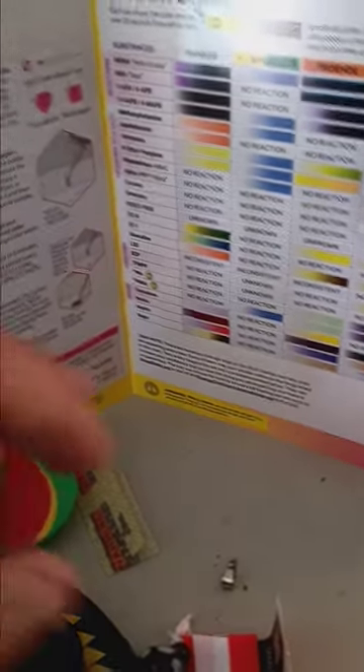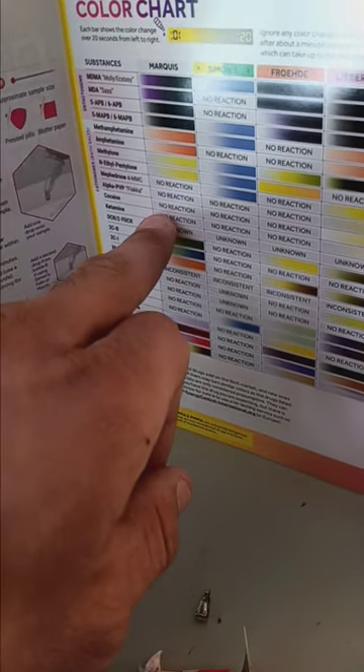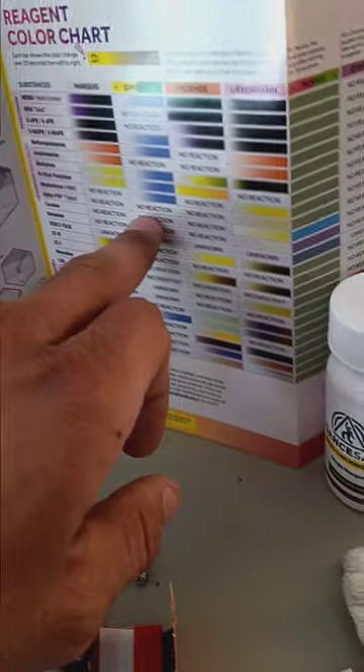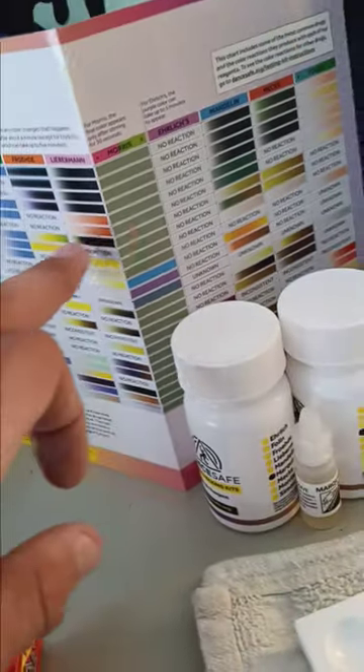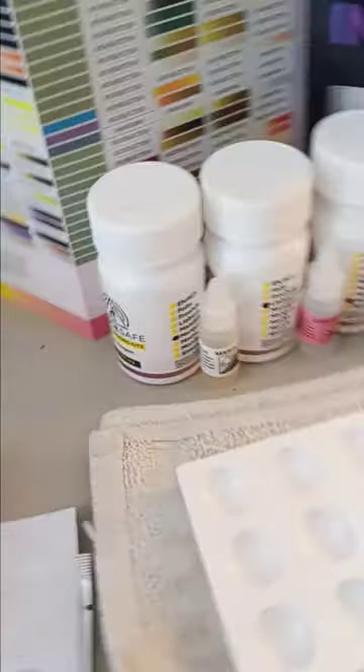So here's our cocaine right here. That means you're going to look for no reaction when you use the Marquis. And when you use the Simons, Froehde, Liebermann, Morris, Ehrlich, Mandelin, Mecke, and Folin — you get the whole idea. You match the color code that shows up to the bottle that is provided.